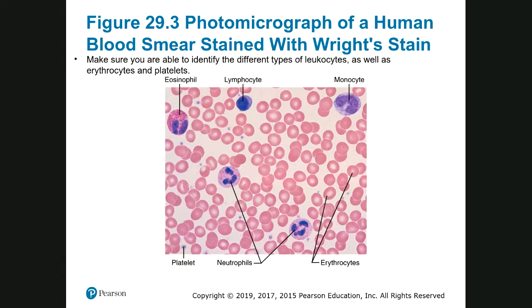The erythrocytes are the red cells that you are seeing over here. And you are seeing also the white cells. Look at these white cells. This is a monocyte, U form. You remember? Kidney shape. You have multi-lobe, that's neutrophil.